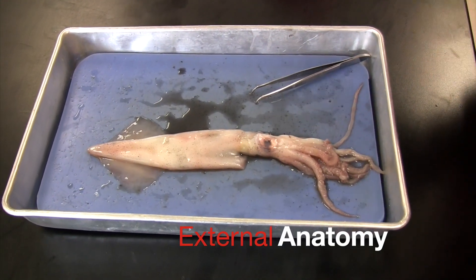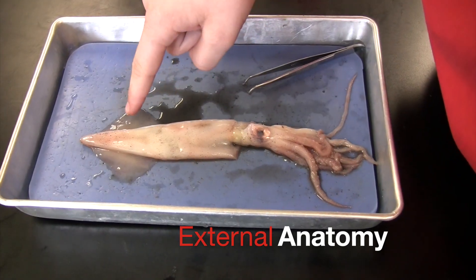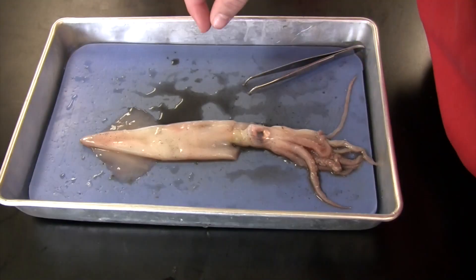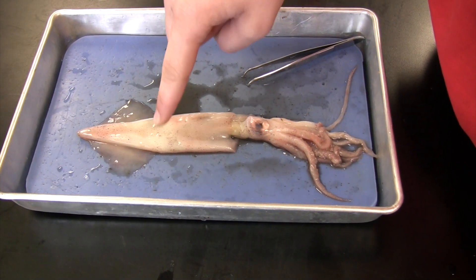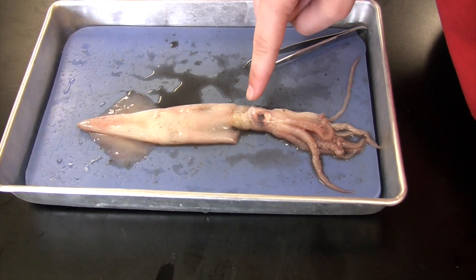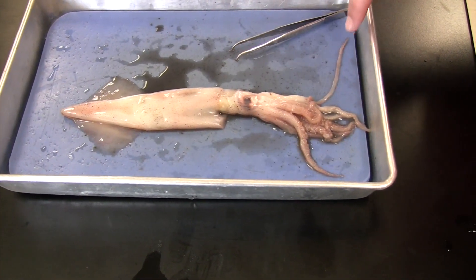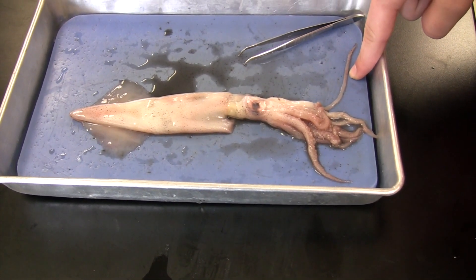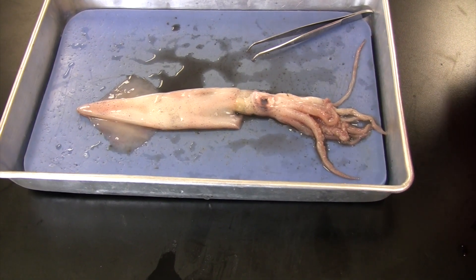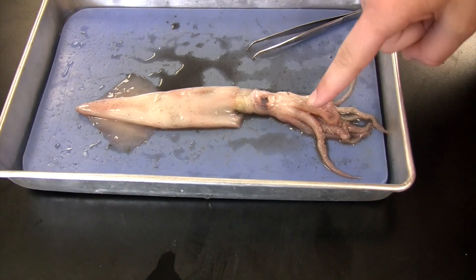I'm going to show you what parts of the squid are. These two are the fins, and then this is the mantle, and then this is the siphon, and then right here is the head. The long things are the tentacles, and then the short ones are the arms.